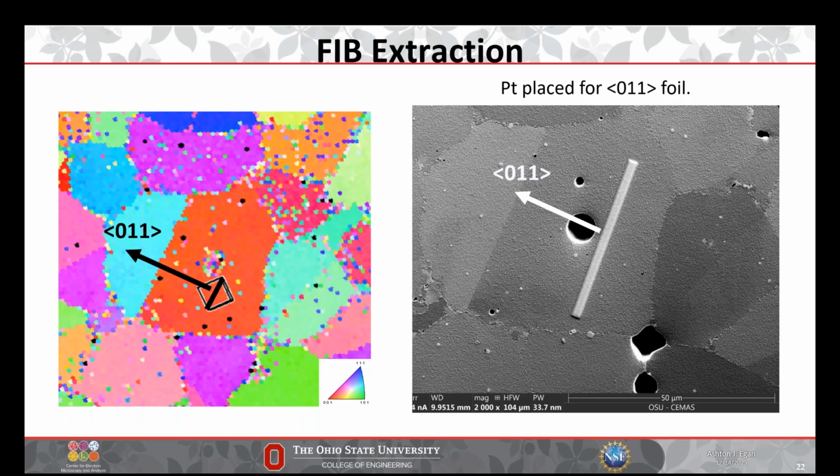That's the relationship. So I drew this along the trace of the plane. In other words, the edge of the plane that I've drawn with the arrow is the platinum, if you want to think about it that way.